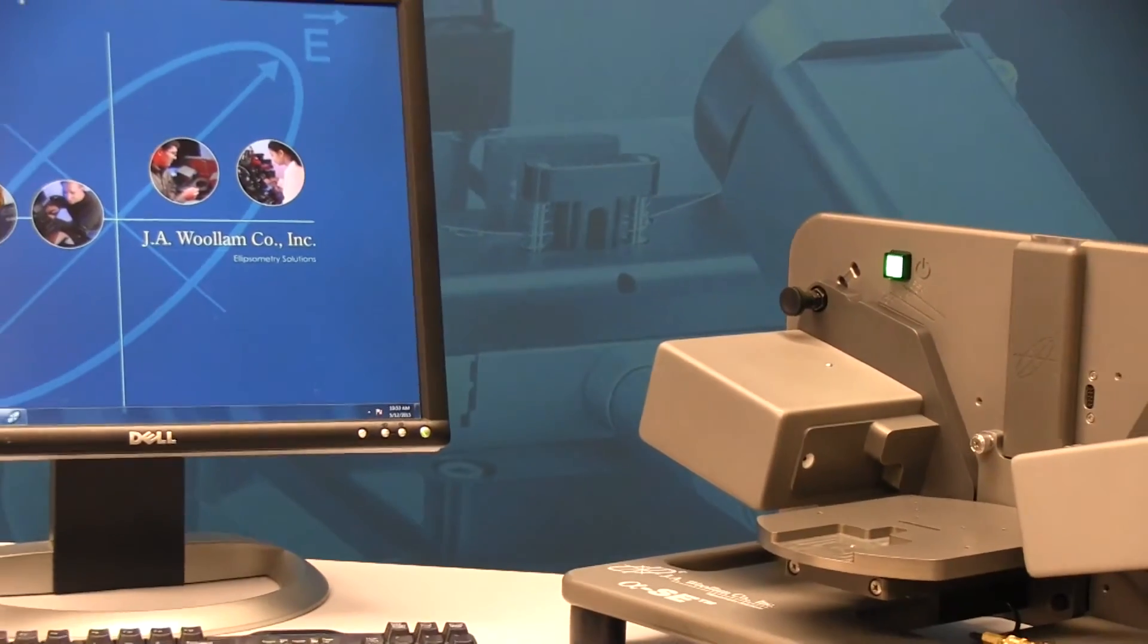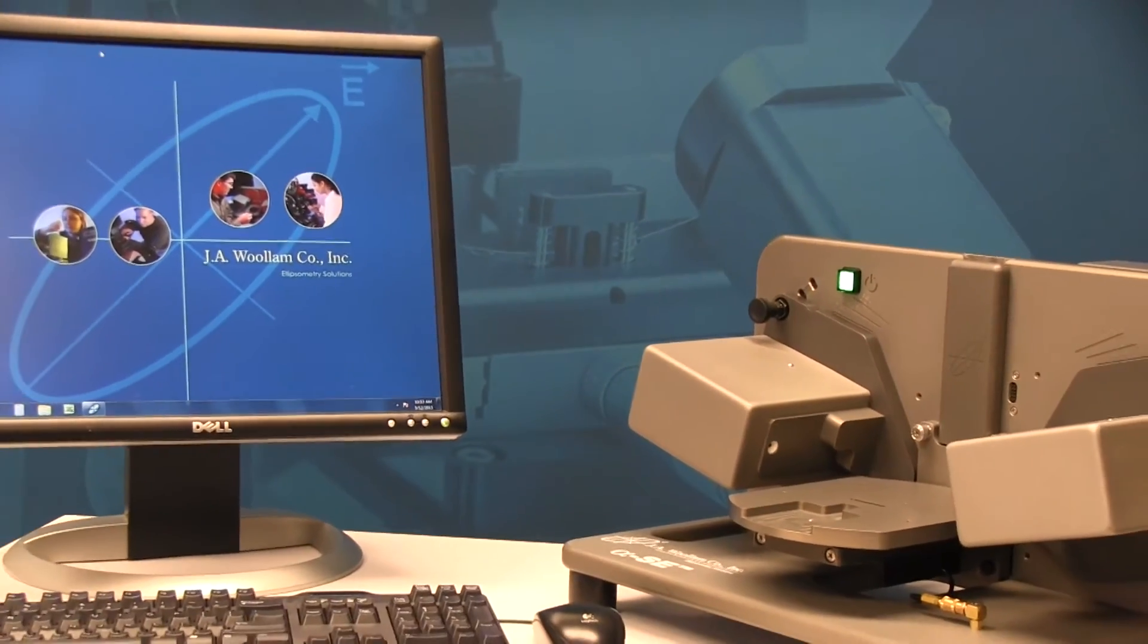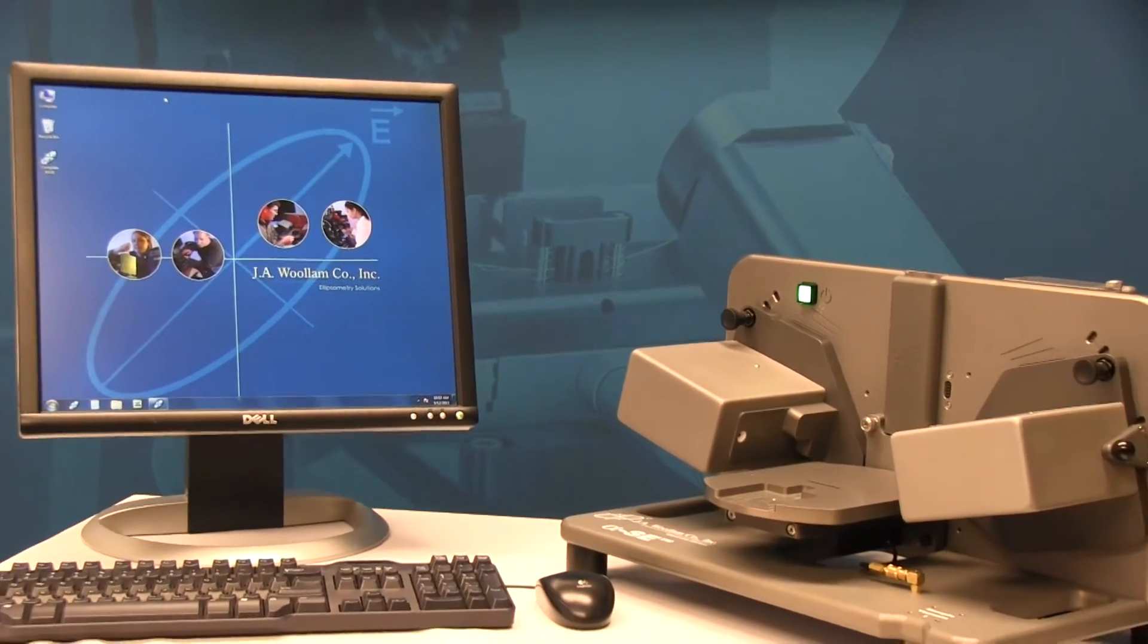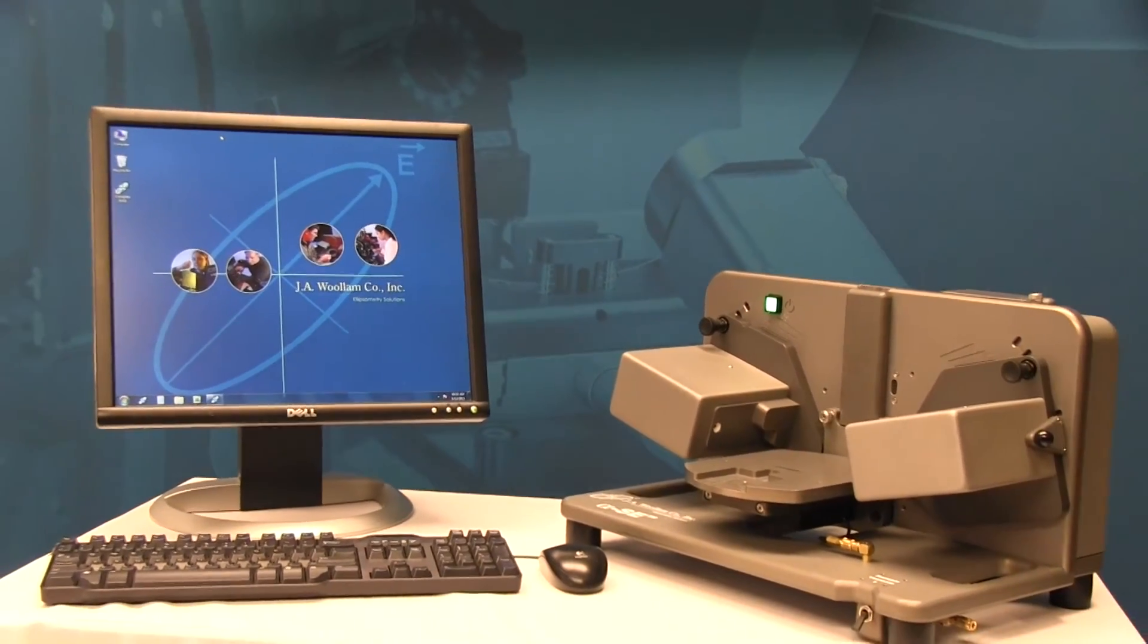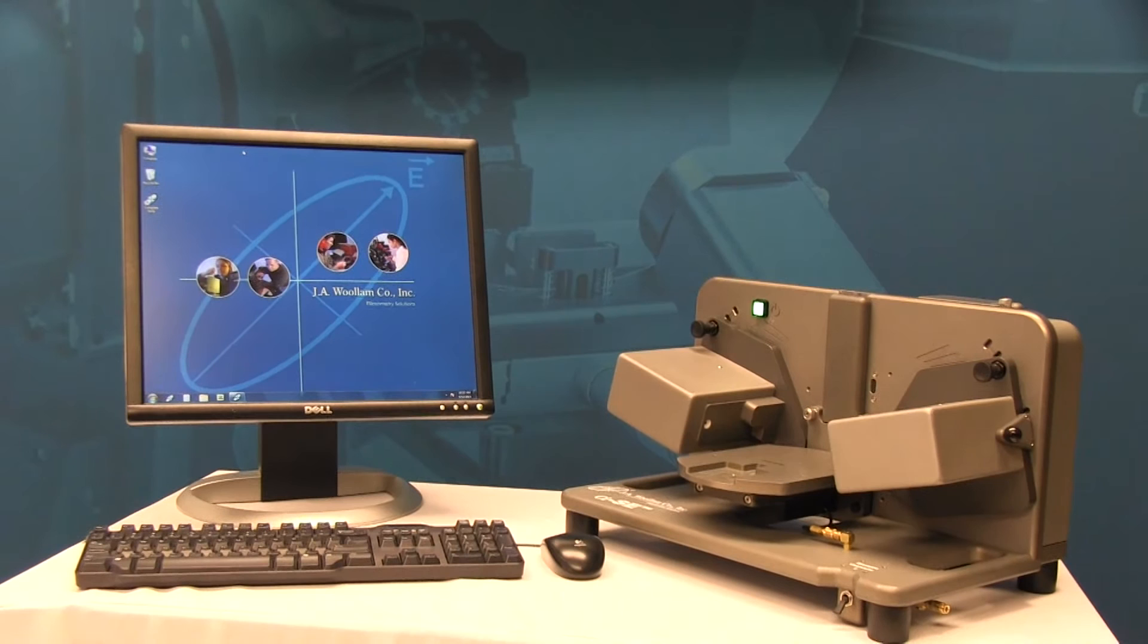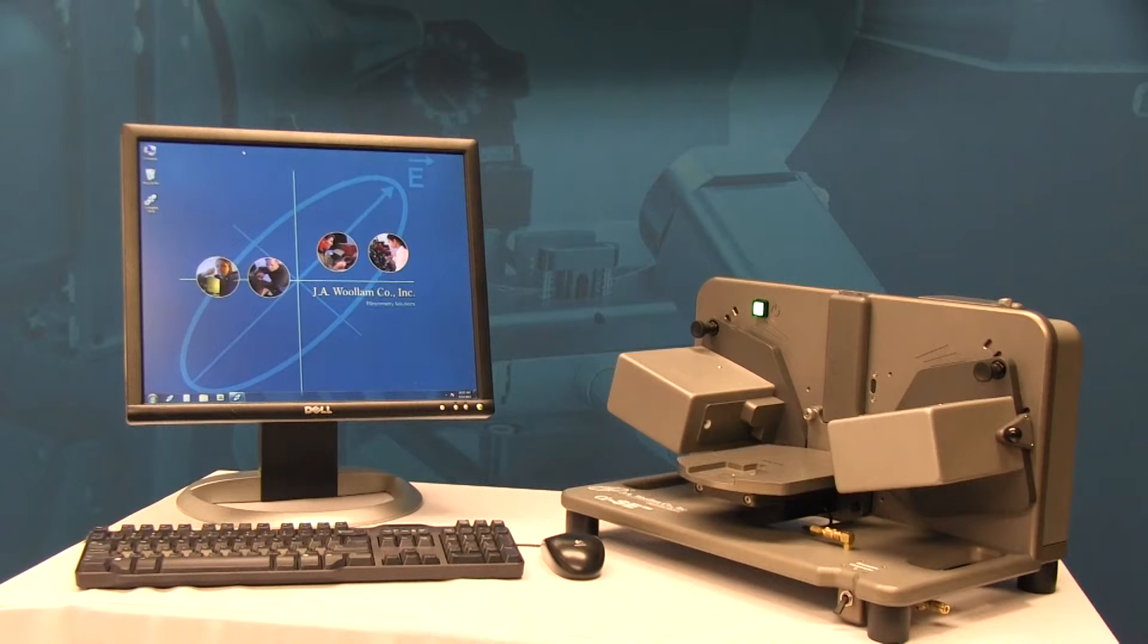The Alpha SE is the ideal ellipsometer for fast, routine measurements of thin film thickness and refractive index. It was designed to provide a perfect balance of accuracy, speed, and price.